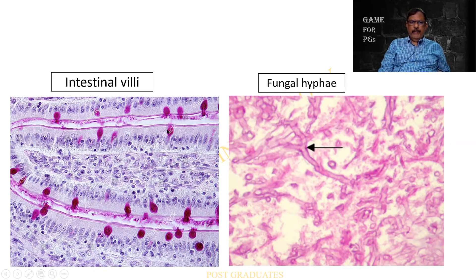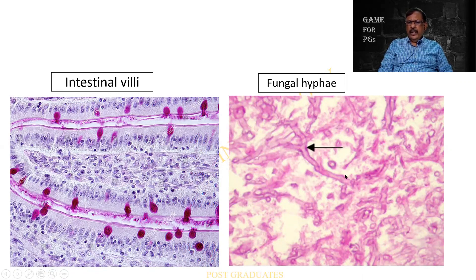Look at these couple of pictures — this is the intestinal villi which is taking up the magenta stain. Normally we will be using the appendix as a control for the PAS stain. In this case, I hope you appreciate the fungal hyphae. Normally in any of our slides, we will not be able to see this many hyphae — because this is a culture in which I am able to see the sporangium, the conidiophore, and the hyphae. All three are seen.